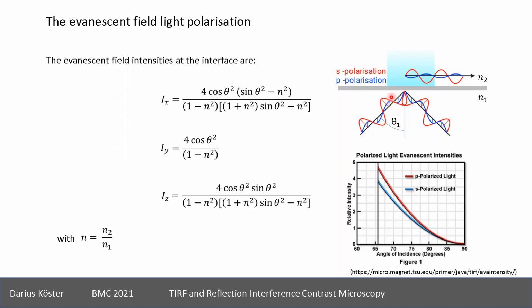That's why it's very powerful to look at surface related structures with a much better signal to noise ratio compared to other techniques, because you get not only optical sectioning, so that you don't actually take in the stuff that is above your sample, but also the intensity very close to the surface is sort of boosted up.